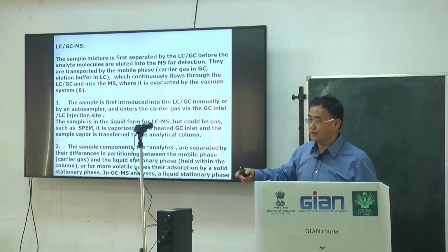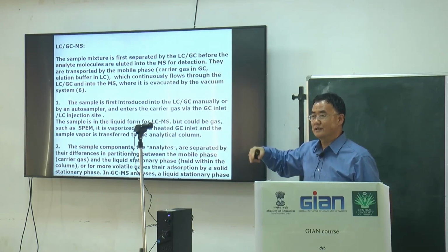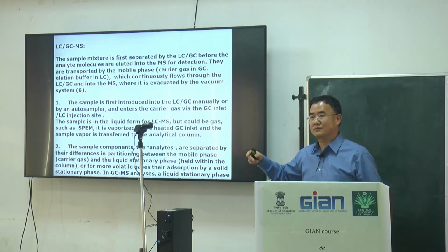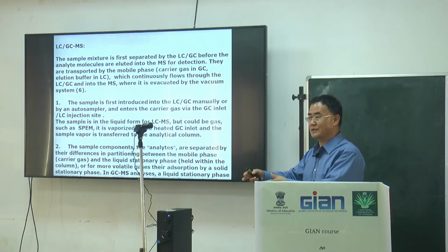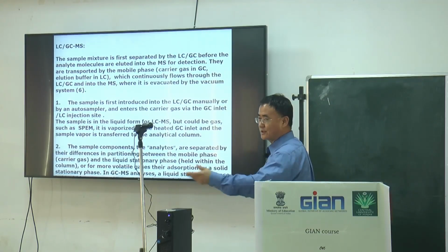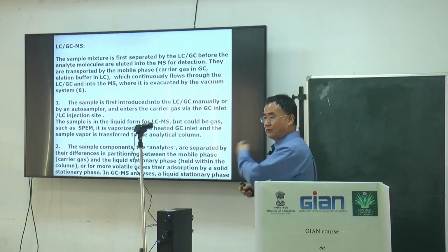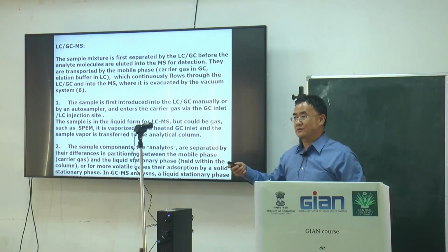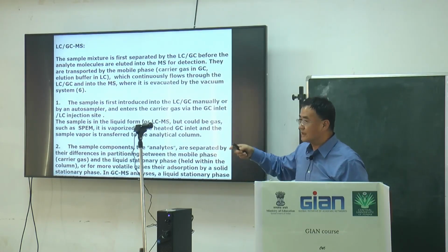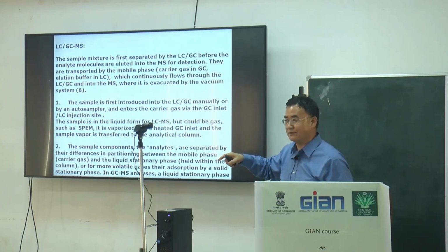We add ammonium to let them be charged with ammonium, or charged with sodium or potassium. We intentionally add those chemicals to let the lipids be charged. Then later it is easier to get the mass spectra during time-of-flight or Q-TOF analysis.